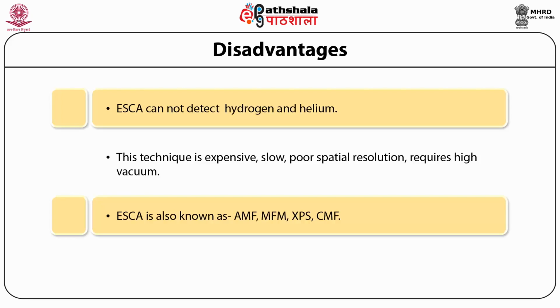But hydrogen, if it is there, we cannot assess. So if hydrogen cannot be assessed, then the analysis remains incomplete. We have to do this analysis by indirect means: whatever is the percentage of all other elements on the surface, we calculate those, and then by subtracting those from 100, we can get an estimate of how much hydrogen is going to be there. Similarly, an estimate about helium is carried out.